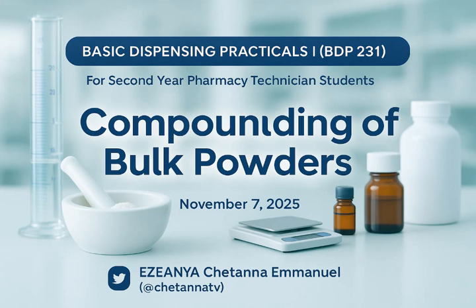If you open the first page of your work, you start here. The topic or the particular product we want to produce. If it is like now we want to produce dusting powder, the first one is dusting powder. Is that clear? So all you need to do is write it in bold letter: Dusting powder. Is that clear? Good. By the time I write a formula on the board, then you can take it off from there.